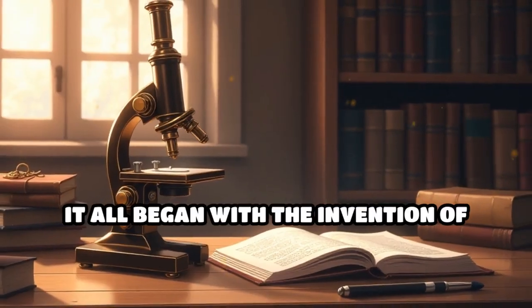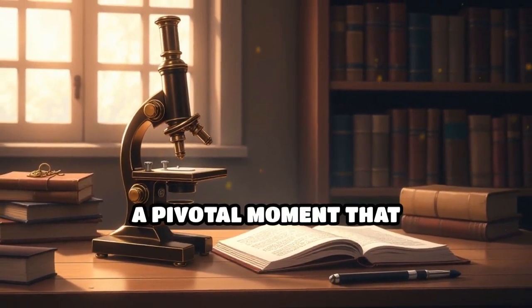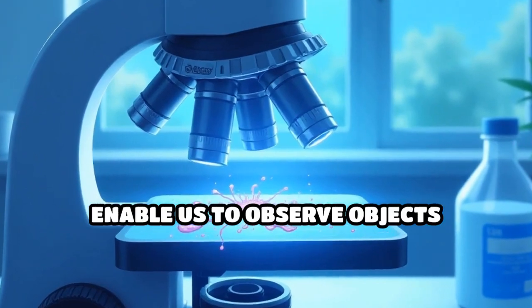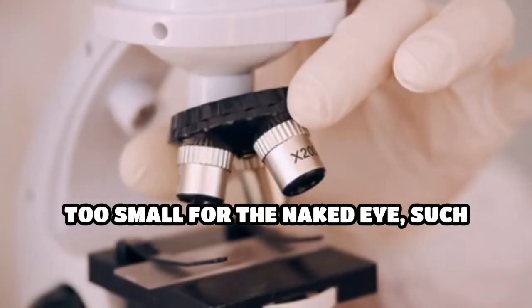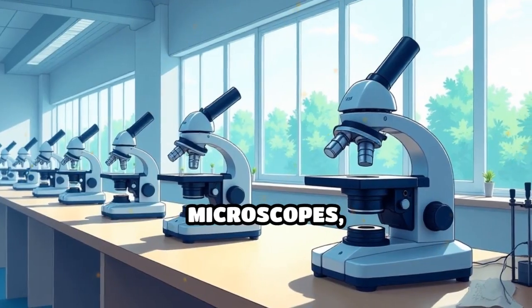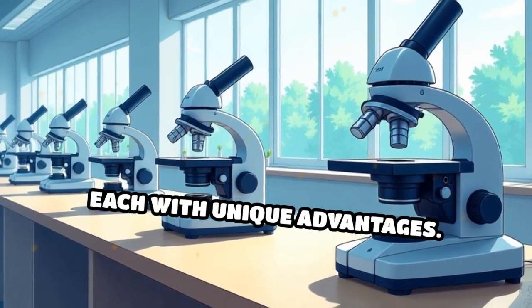It all began with the invention of the microscope, a pivotal moment that transformed our understanding of life at the cellular level. Microscopes enable us to observe objects too small for the naked eye, such as cells and microorganisms. There are various types of microscopes, each with unique advantages.